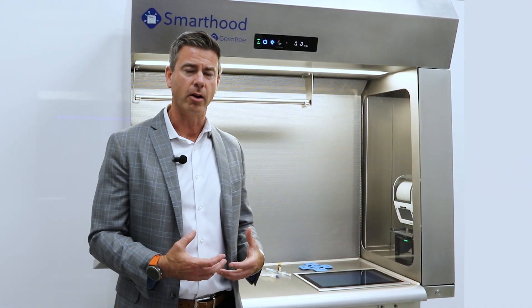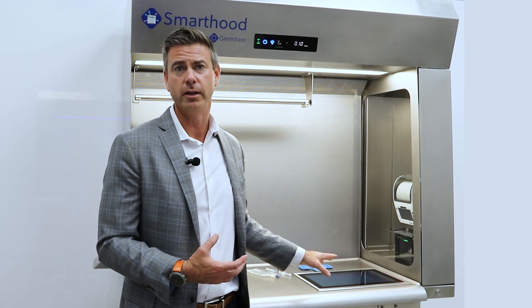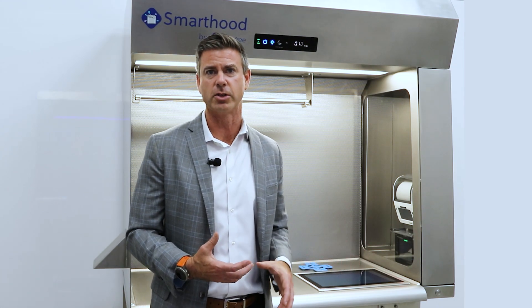What we mean by that is we have integrated all the peripherals needed to run IV workflow into the IV hood. This is a first because now we're able to run whatever IV workflow solution you want, with the peripherals directly built into the smart hood.